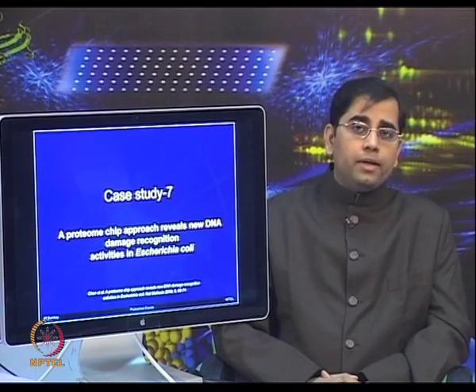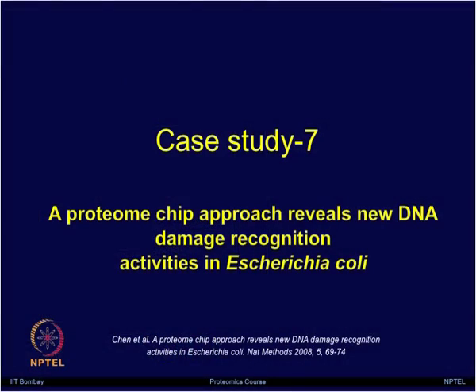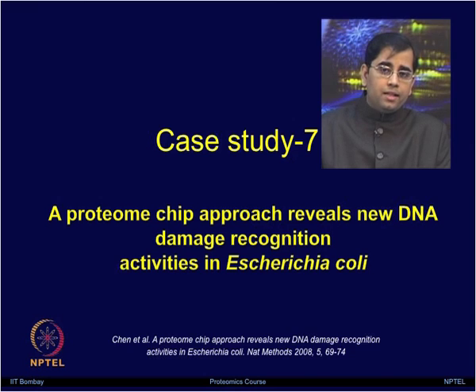Let us discuss now case study 7. A proteome chip approach reveals new DNA damage recognition activities in Escherichia coli, a study by Chen et al.